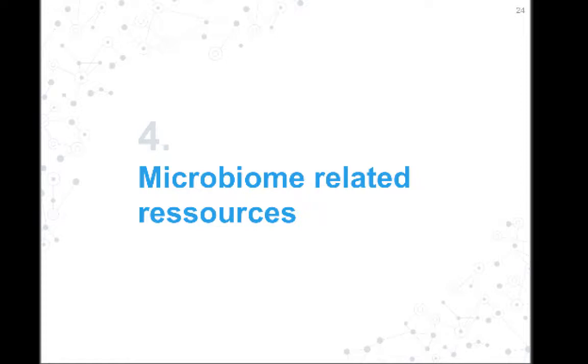So you have all your sequences and your populations in your samples once you have done all your analysis. And now you need to dig further and answer various questions, such as what this population means for the body. Is it linked to a disease you are studying? What are the impacts on the health of the patient? What kind of products can my bacteria population create and deliver to the body, etc.? And in summary, what the genetics of the microbiome tells you. That's what you want to transfer.